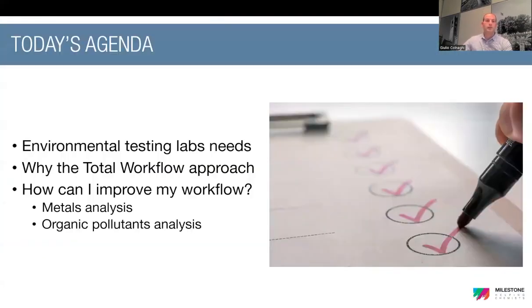And today, during my presentation, we will go through the environmental testing lab's needs. Then we will take a look at why you should consider the total workflow approach and how to practically improve your workflow for metal analysis and organic pollutant analysis.